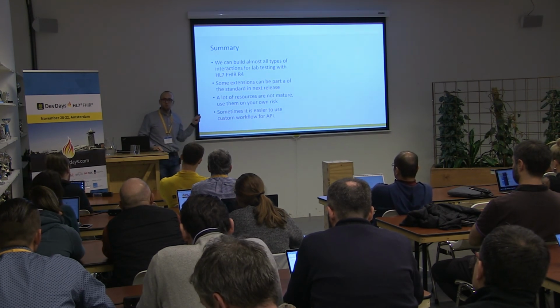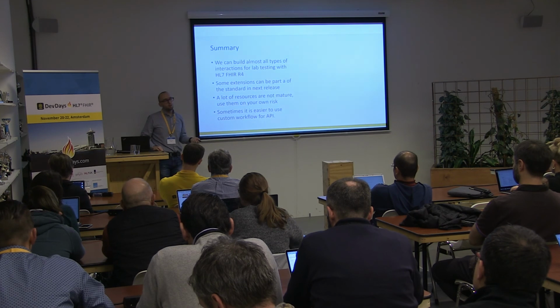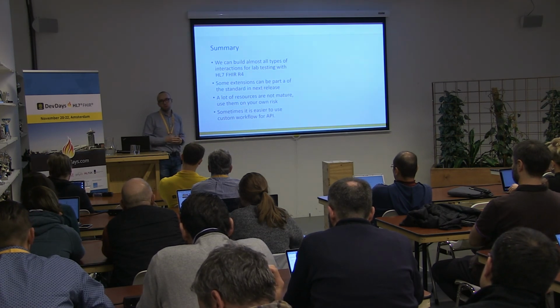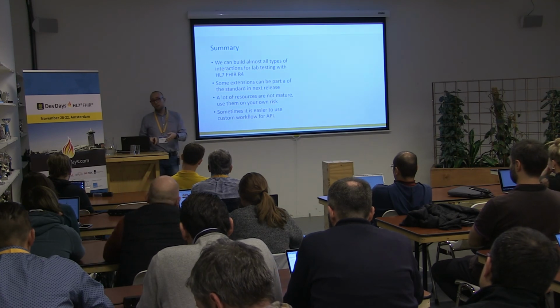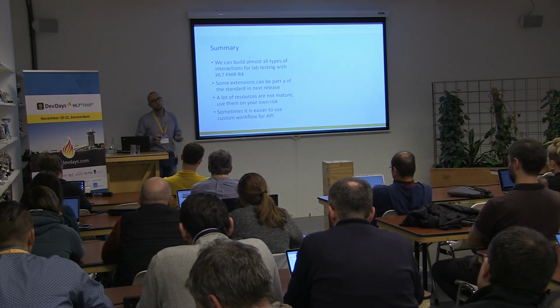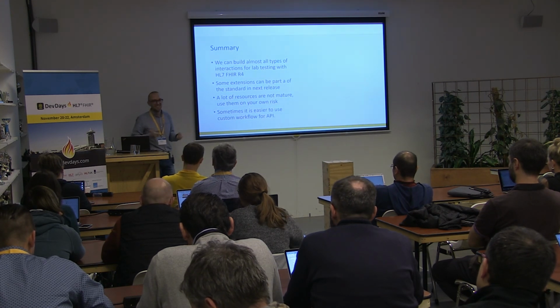We try to encode observation definitions with LOINC. So we tell our customers that the result of the test will contain such a set of observations. And we use LOINC there, yeah. And it's not a government requirement, it's just our own decision, because we believe in LOINC.